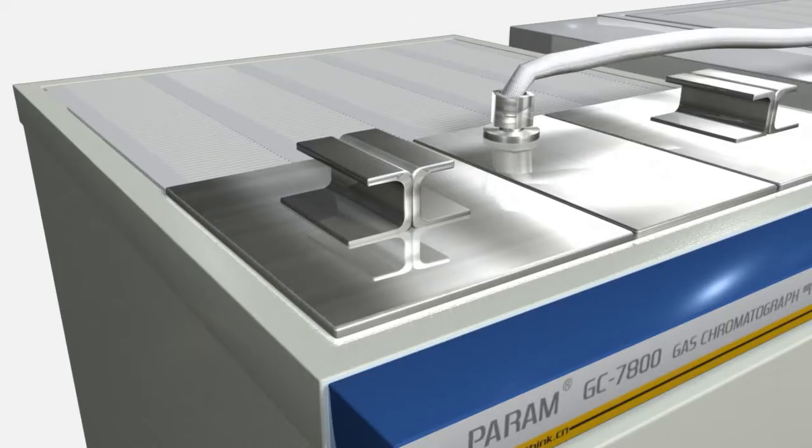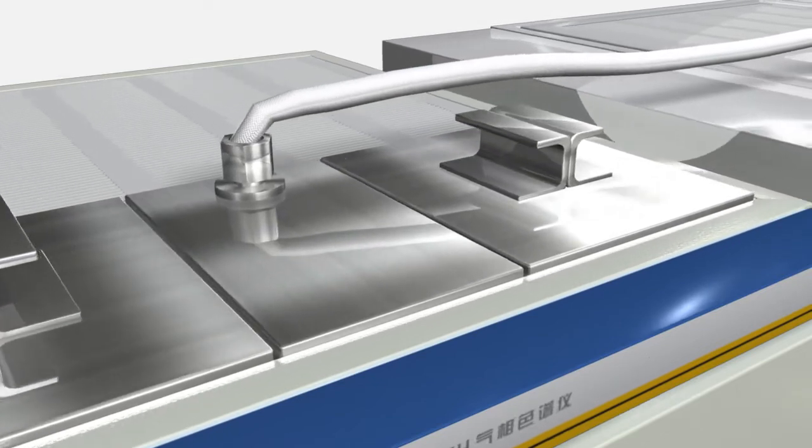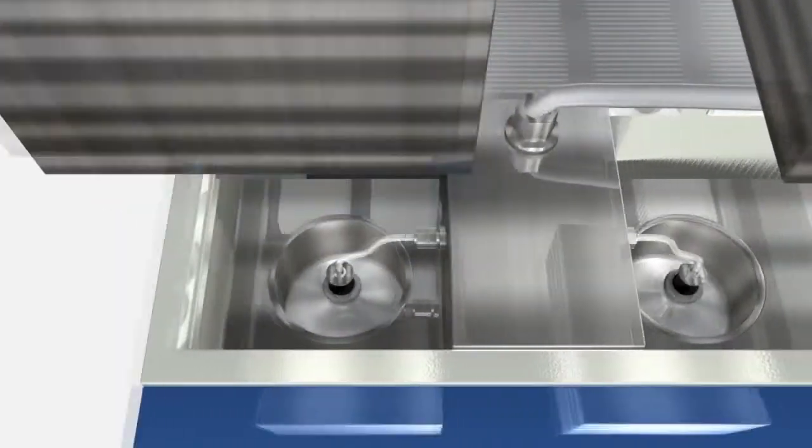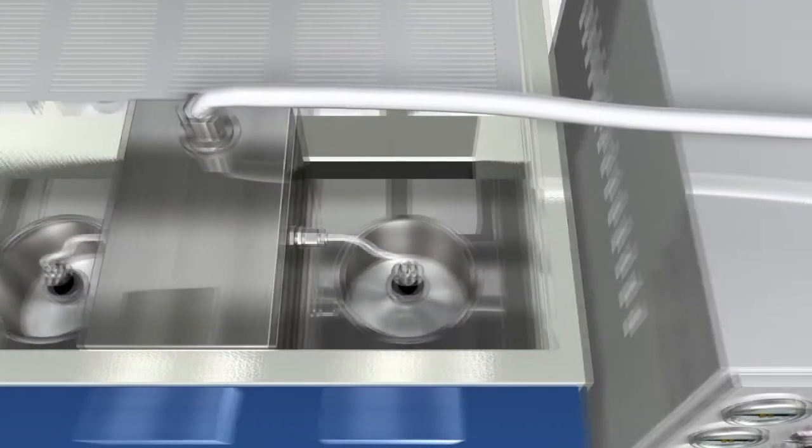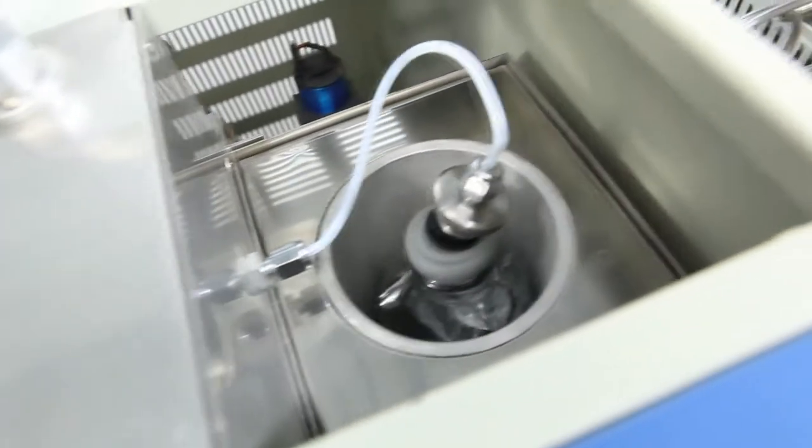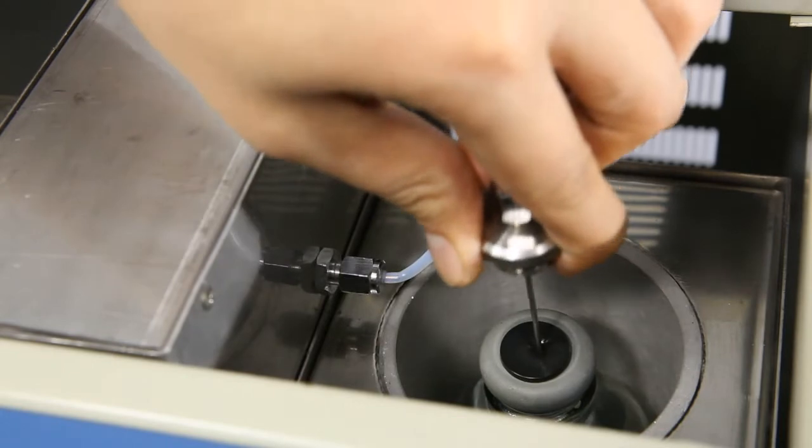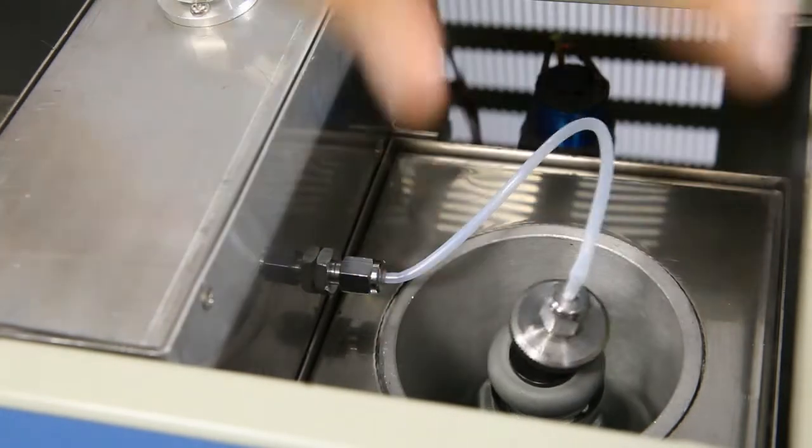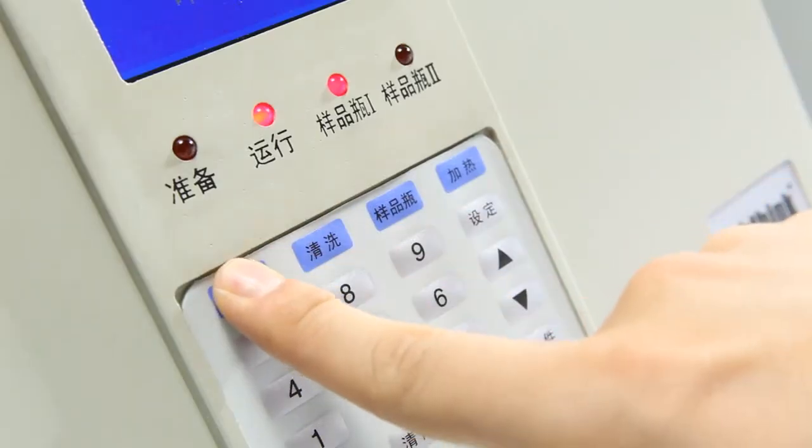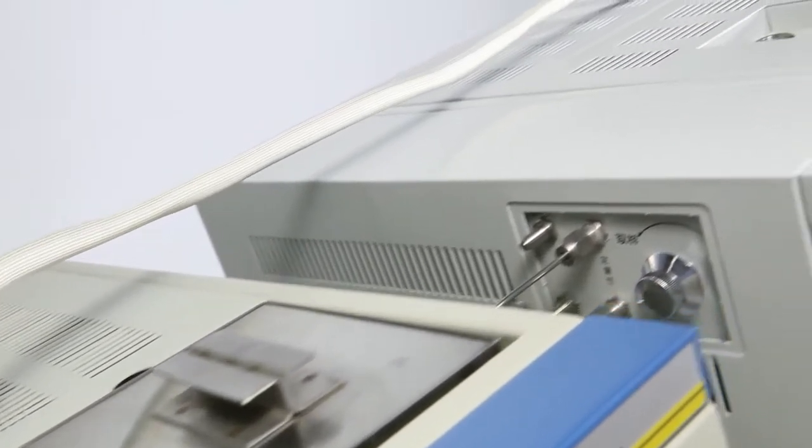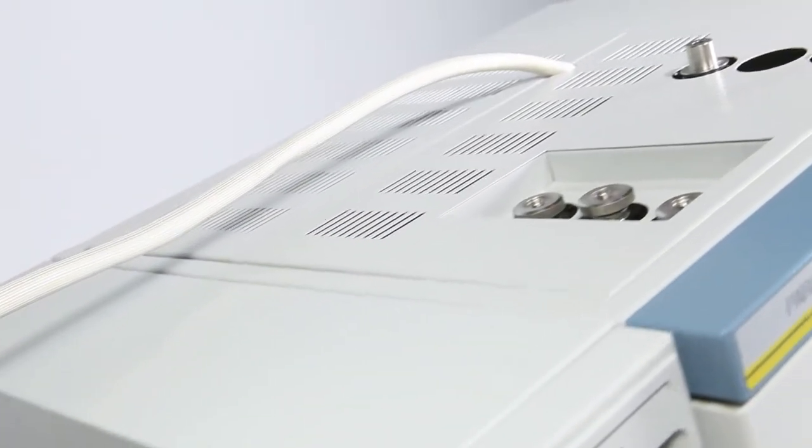The auto sampler has two large volume thermostatic chambers. This device can perform automatic sample injection and testing of two different samples in a predetermined order. Users only need to insert the sampling needle into the headspace bottle, press start, and the system will accomplish the sample injection and analysis automatically.